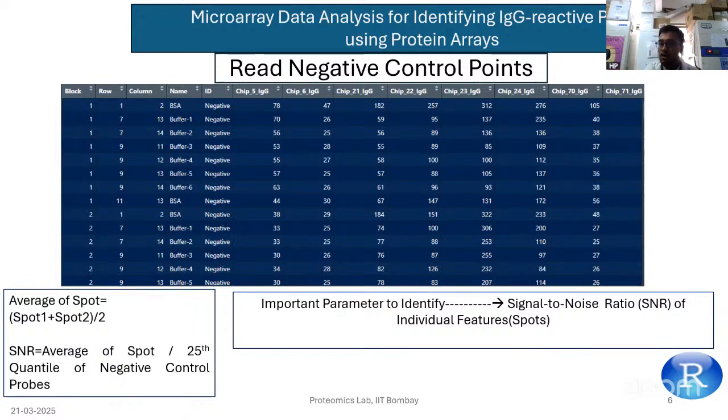But the his tag, or the next one, like sir said, the flag tag, is also printed, but maybe we are not taking care of it for this analysis. So how you are eliminating this, because it could be taken as a negative control. How you specifically eliminate these two features, his tag, from the overall list, considered to be a vector for R, is also coding expertise. So I'm trying to balance how a biologist and a data analyst work together to finally come up with the result.